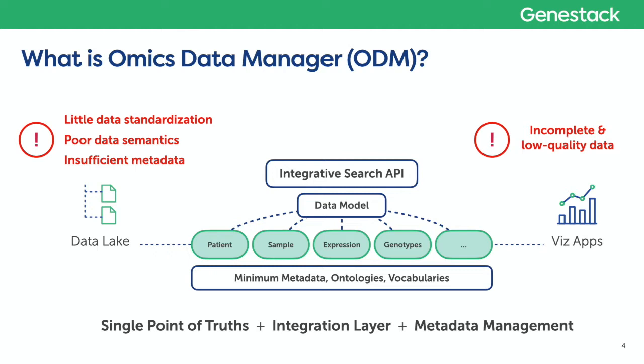On the other end, visualization application development tends to suffer from incomplete and low quality data. ODM addresses this gap by providing a single point of truth to structure and standardize different data types, an integration layer to capture their relationships, as well as various tools to curate and validate metadata.